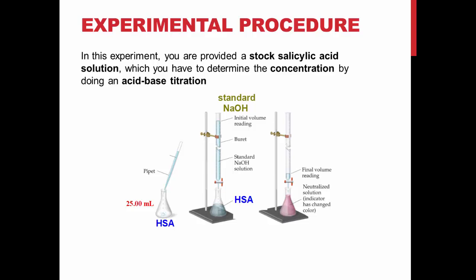Titrate 25 mL portions of salicylic acid solution with sodium hydroxide solution using phenolphthalein as an indicator. The amount of sodium hydroxide used can be used to determine the concentration of salicylic acid in the solution using the stoichiometric ratio of the reaction.